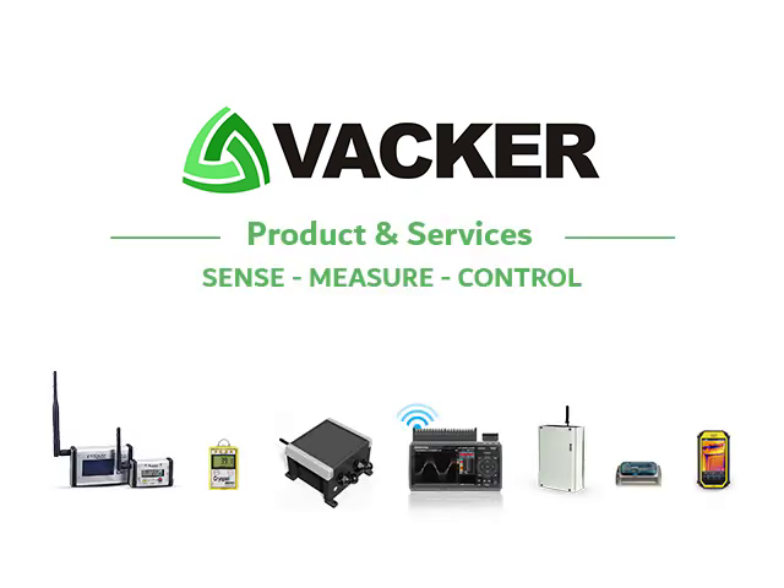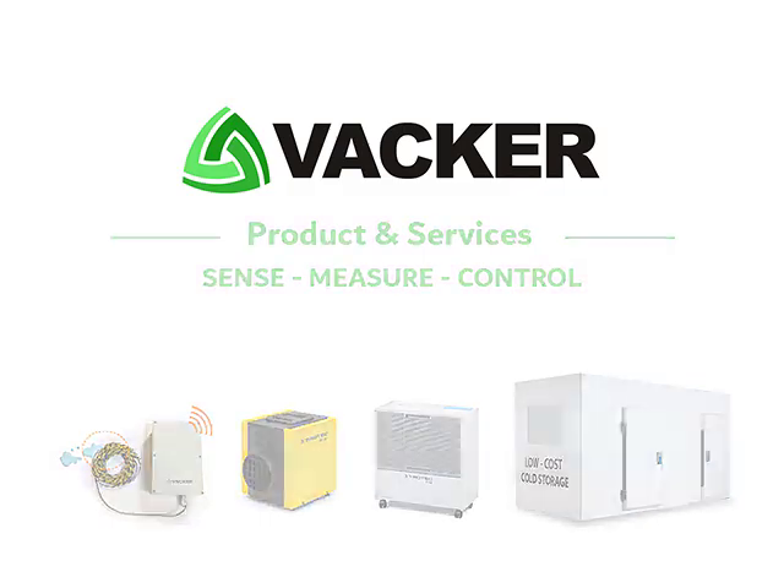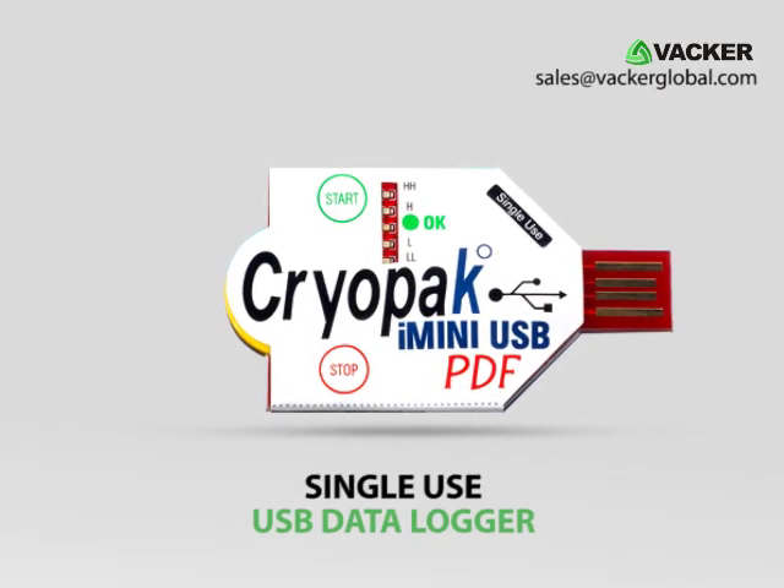Welcome to Vacker Global for information on hundreds of technical products and services across the world. This is the latest model of single-use USB data logger.